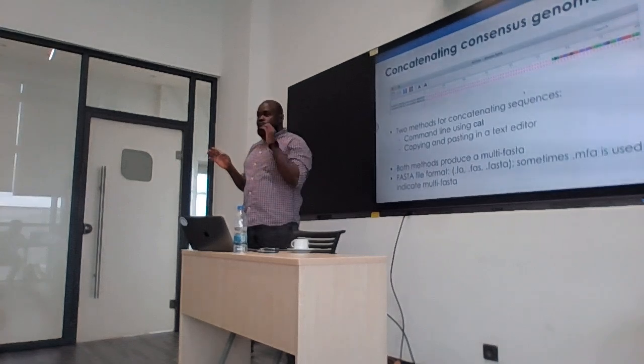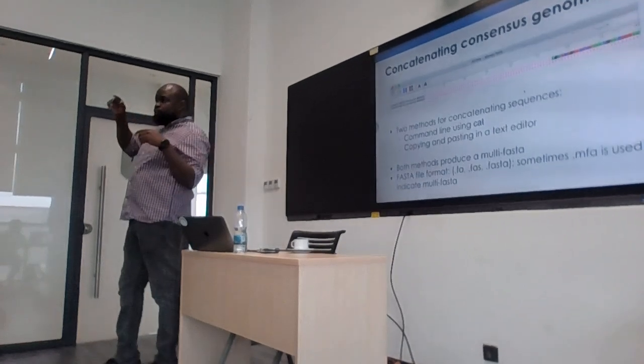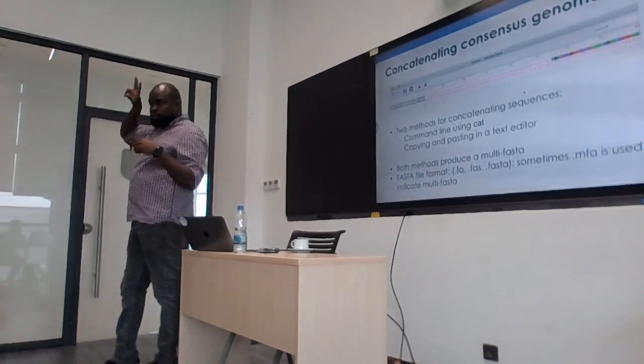Did somebody finish the run? Did you finish? Okay, good. Do you have the file that you ran initially before with the two samples? Is it also there? Good.